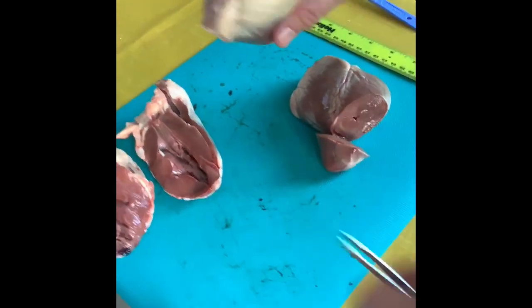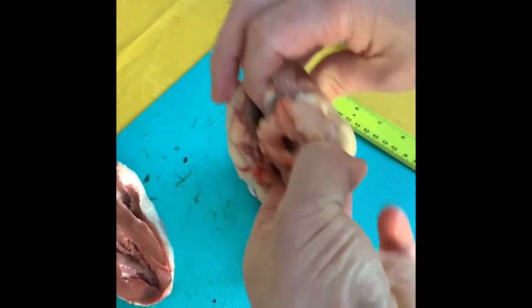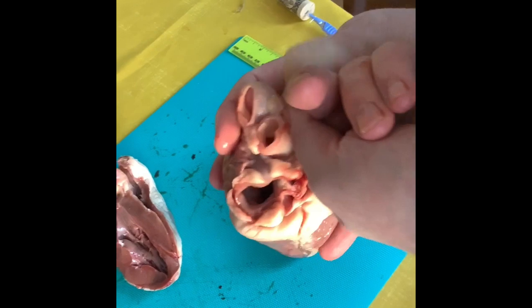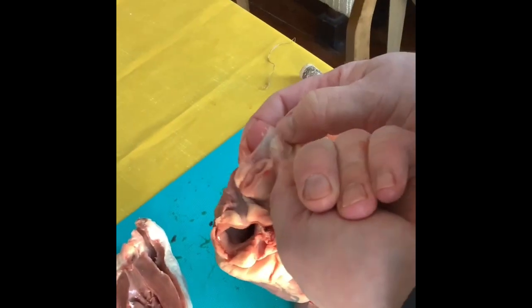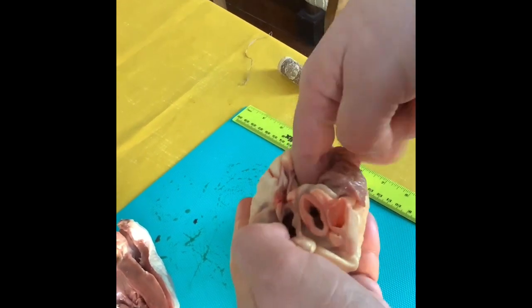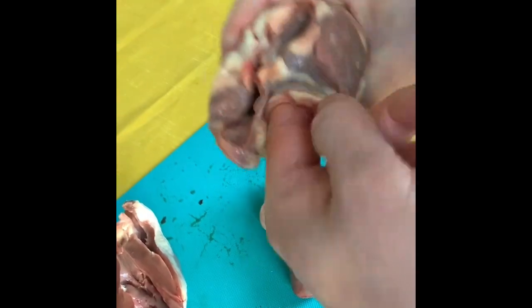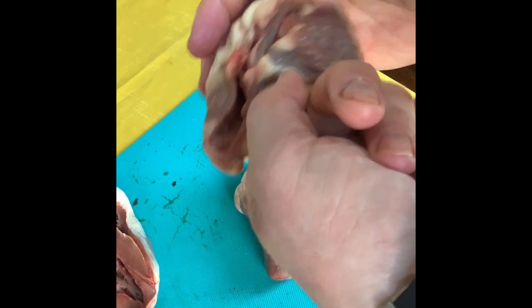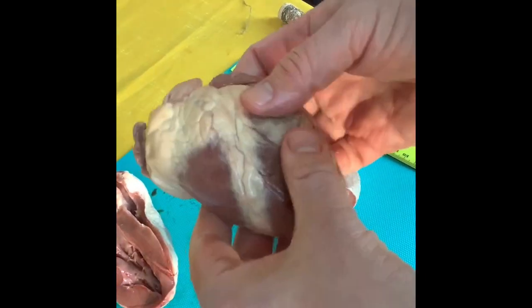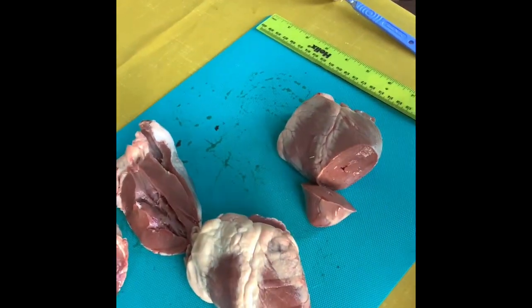We can see some of the blood vessels here. I know this is the right-hand side because it's thinner. If I push my finger up through this vessel — so this must be going off to the lungs, meaning this is the pulmonary artery. Whereas this other vessel ends up on the left-hand side, so that is the aorta. Once we're back in class we'll look at this in more detail.